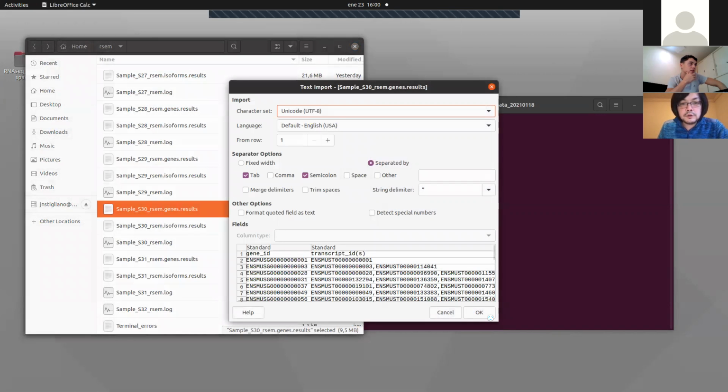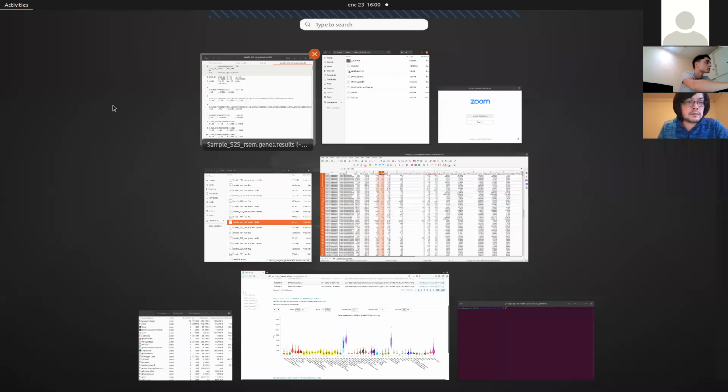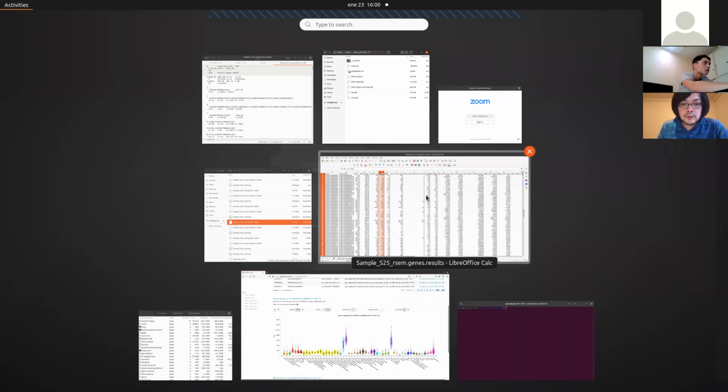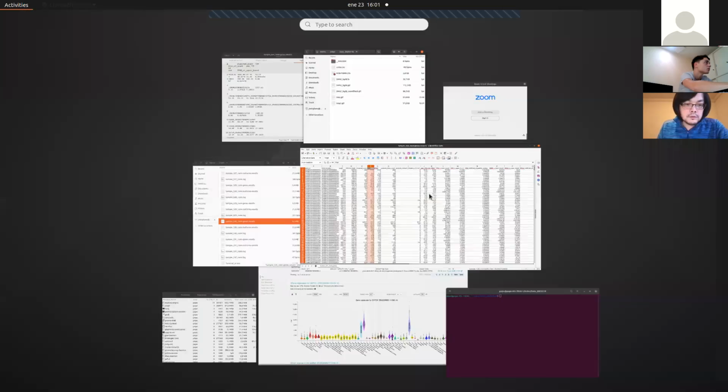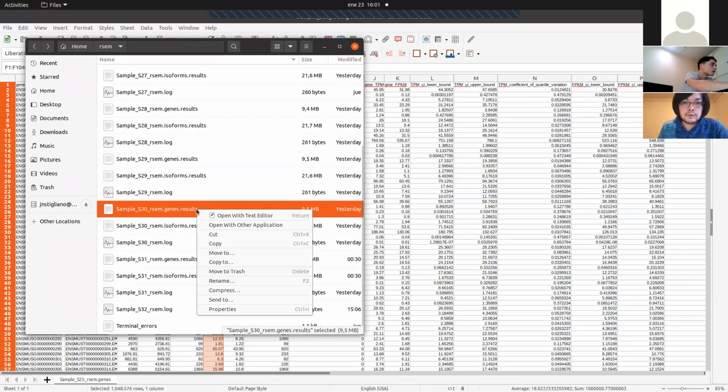But it's hard to visually compare, unless you have a gene of interest, where you know which gene should go up, then you can easily check. Sorry, here. Yeah, it is 25. The one I opened is not here.